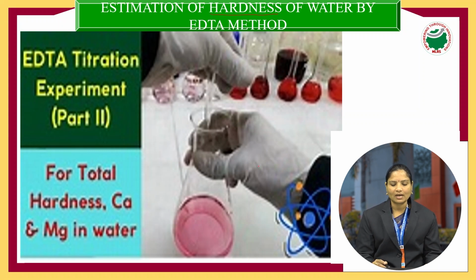Based on the presence of these bicarbonates, chlorides, and sulfates in the water, there are two types of hardness: temporary hardness and permanent hardness. In this EDTA method, we have to find out temporary hardness, total hardness, and permanent hardness. So, let us discuss the estimation of hardness of water by the EDTA method.